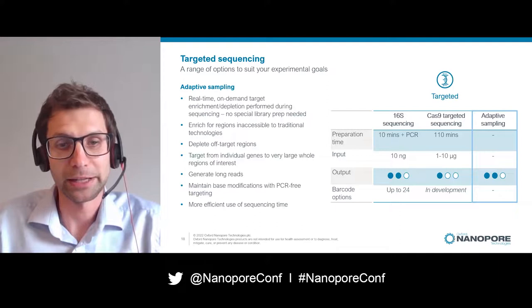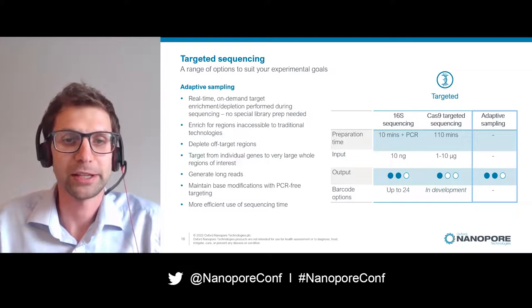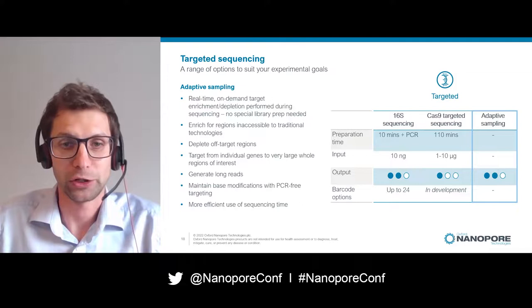We can analyze the molecules while they're passing through nanopores and then eject them from the nanopores, which means that we increase the time spent on sequencing our loci of interest and make data collection more efficient.